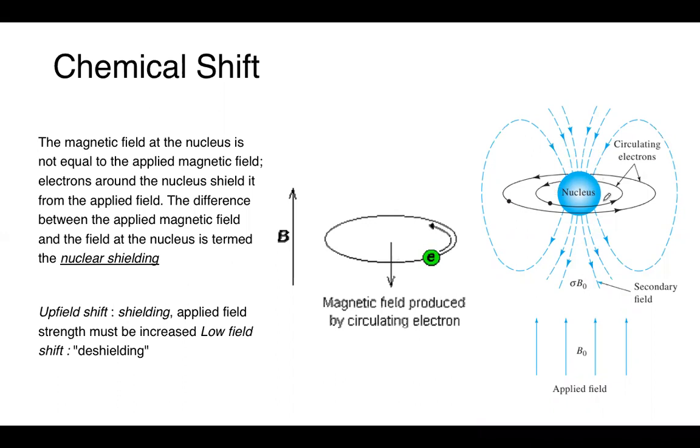So we see another schematic of it here. We have the magnetic field of the nucleus, which is going in this direction. You can see it passes through here and here through the nucleus. We then have an applied field, which is our B0. But what happens is that this magnetic field surrounding the nucleus is protected by the circulating electrons going around. And so these shield it, preventing the full effect of the applied field from being felt on the nucleus. And I think we'll leave it there.